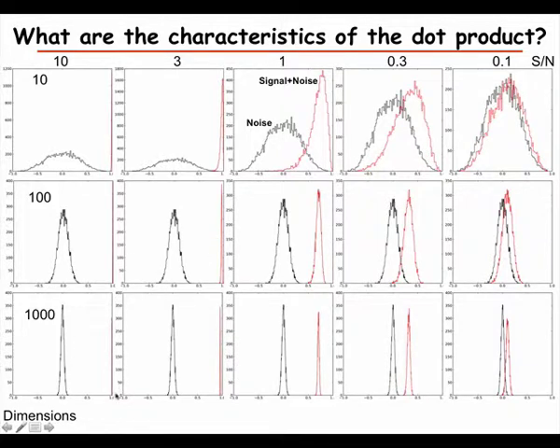So then this might be difficult to see, but if we have the signal to noise ratio of 10 and just have identical vectors and add a little bit of noise, the peak is very close to 1 here. You see the red peak here. And as we then increase the noise, so decrease the signal to noise ratio going over this way, we see that the random peak stays where it is, and the red peak goes down and gets closer to the random peak.